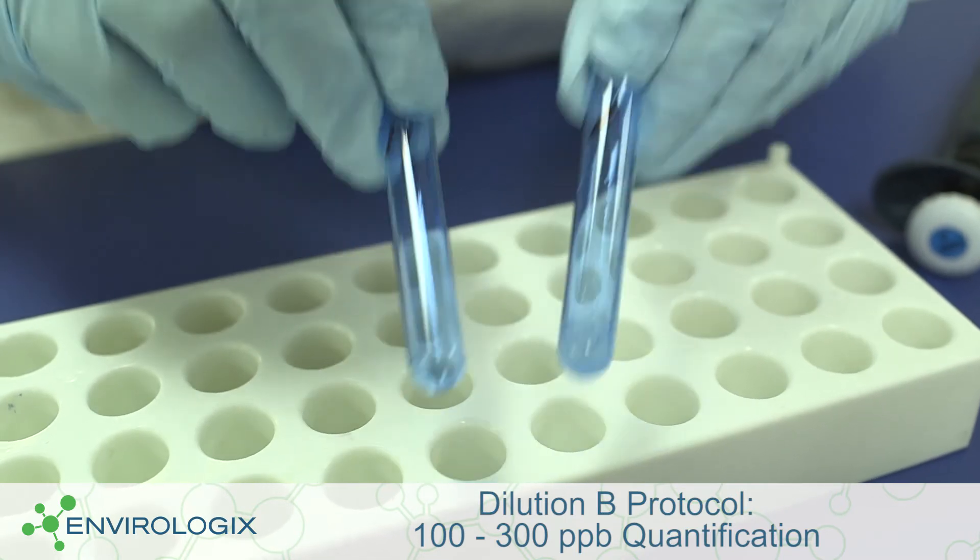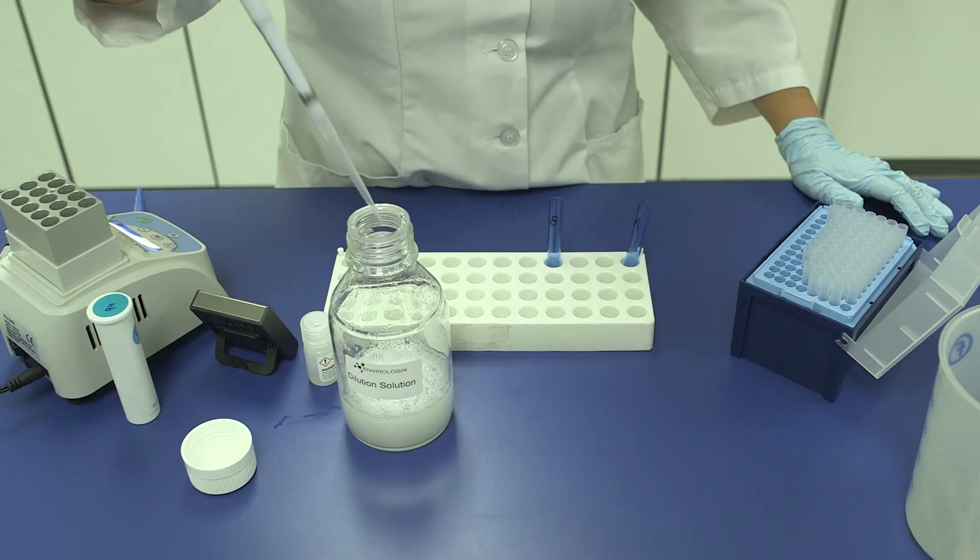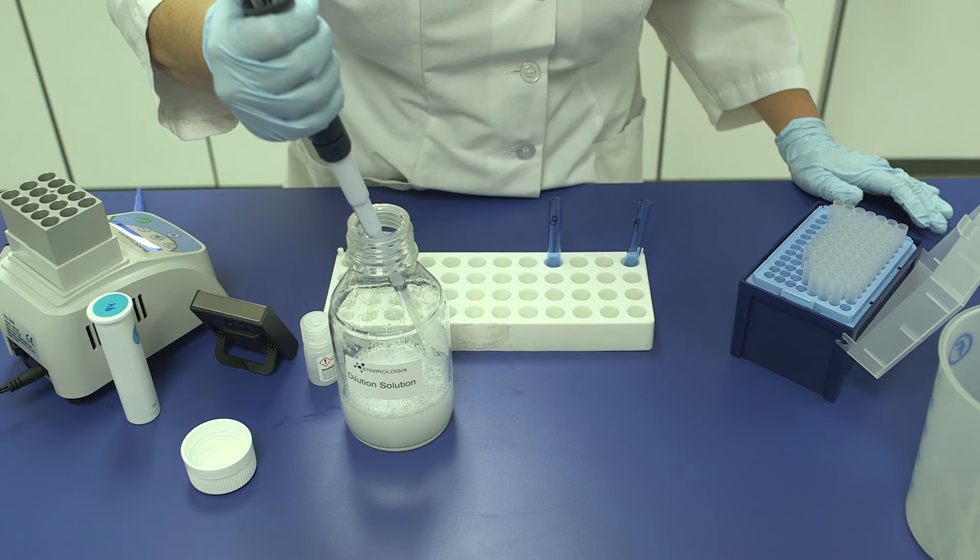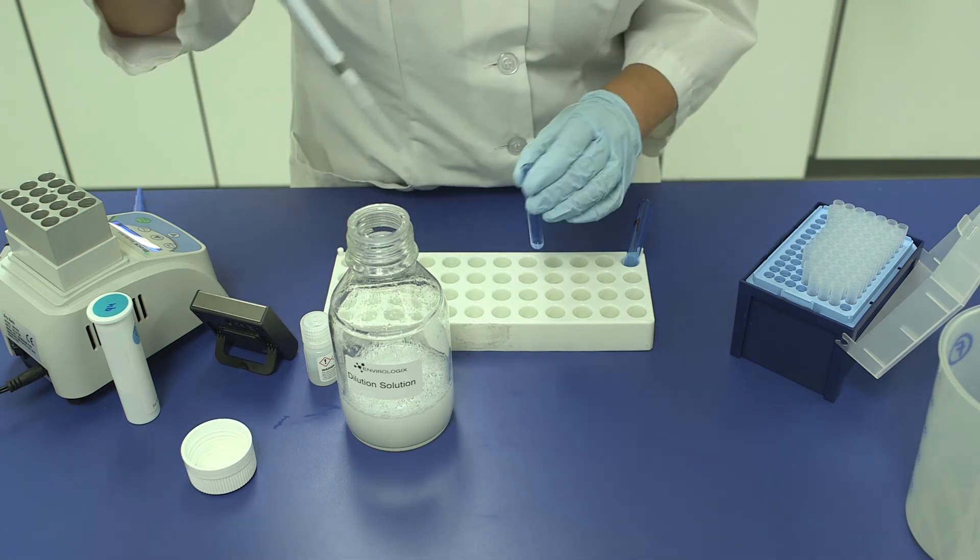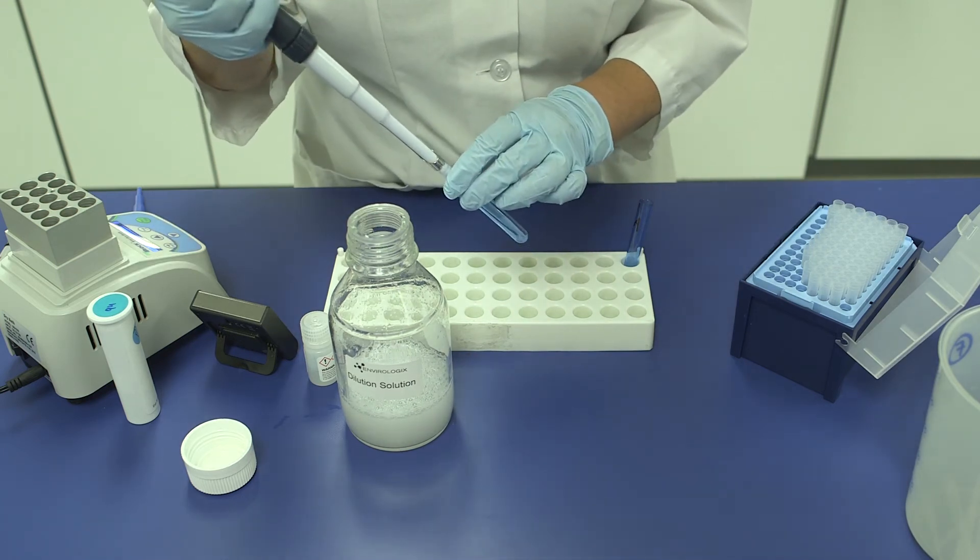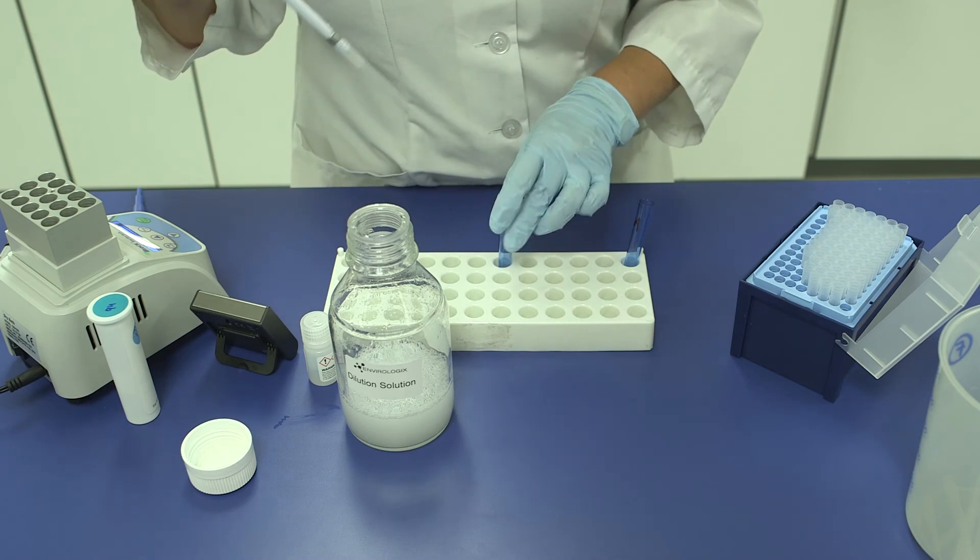Dilution B, Step 1. Add 200 microliters of well-mixed dilution solution and 100 microliters of the dilution A extract to a clean tube and mix well.